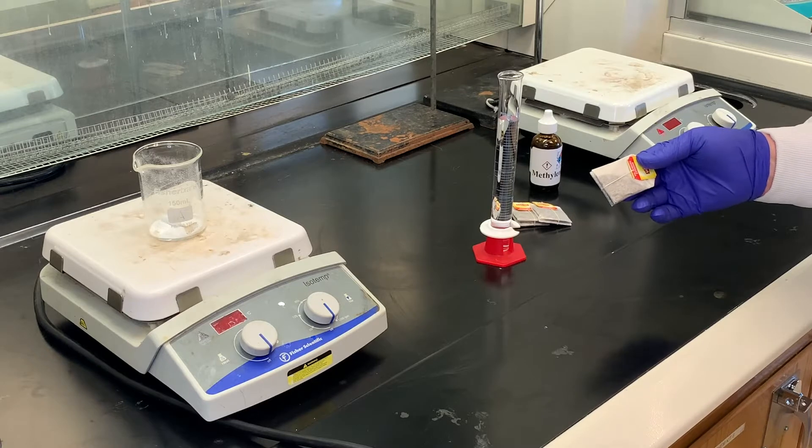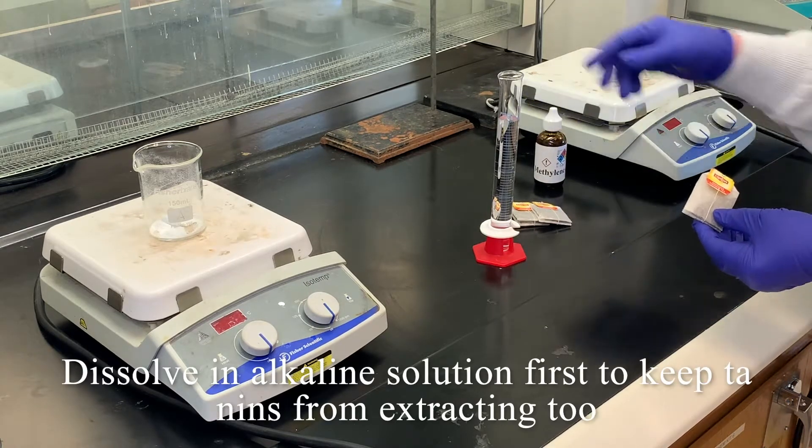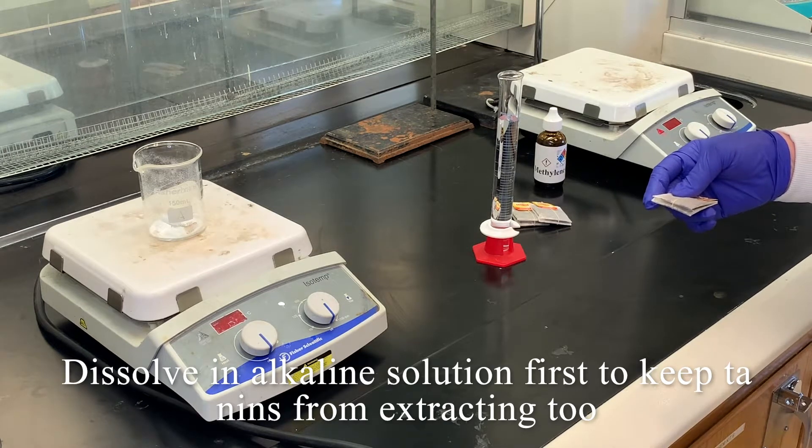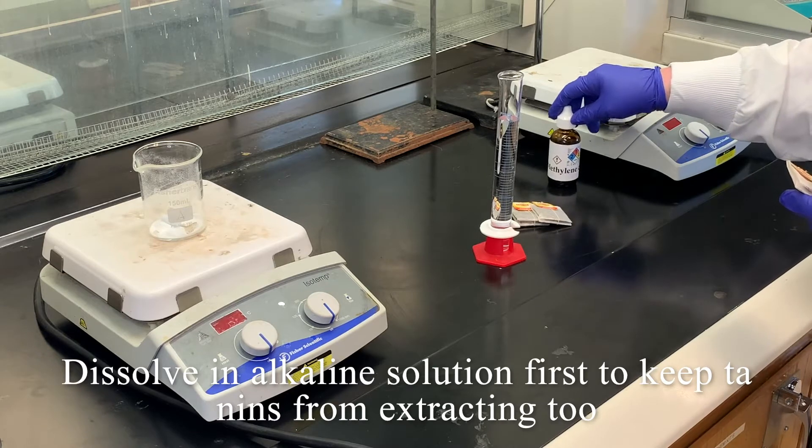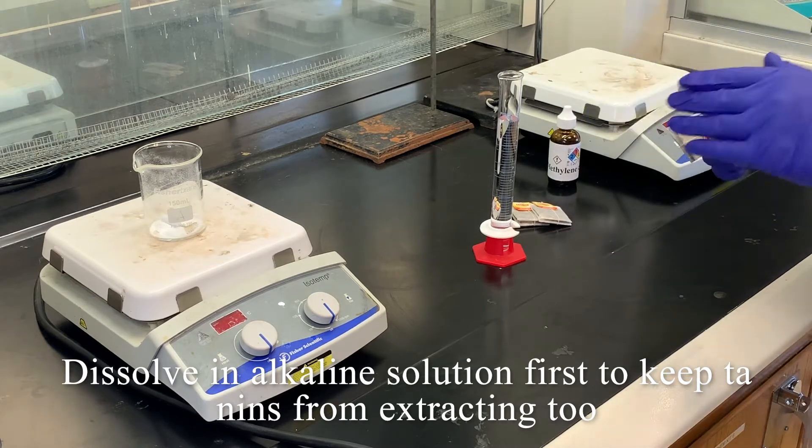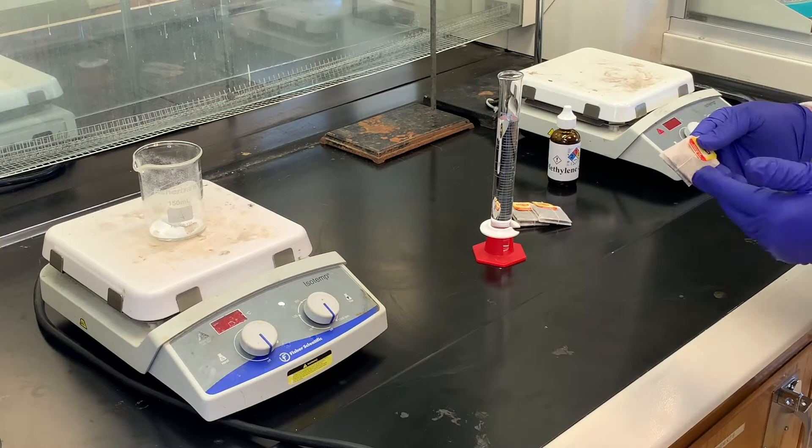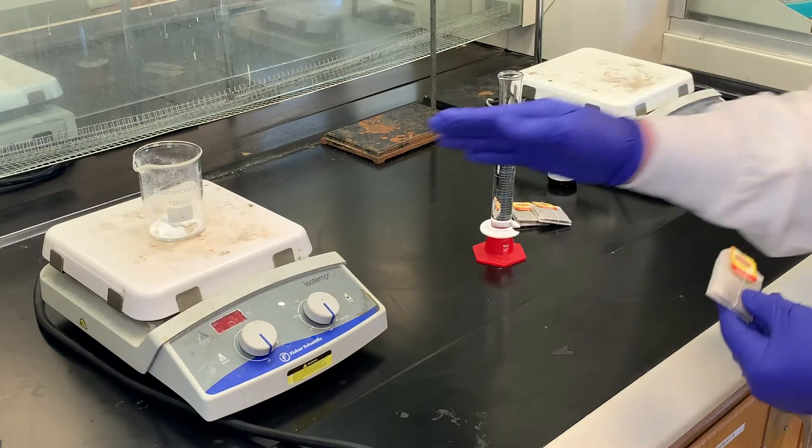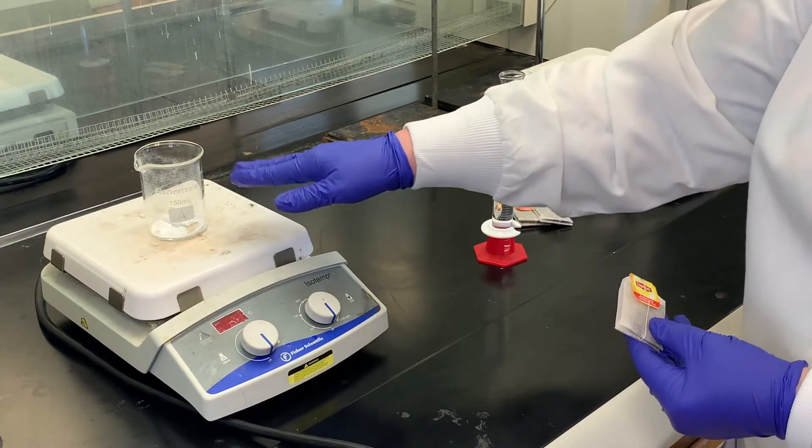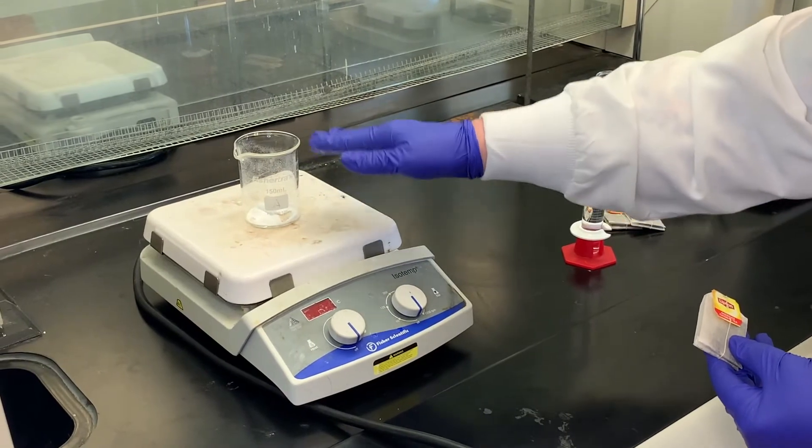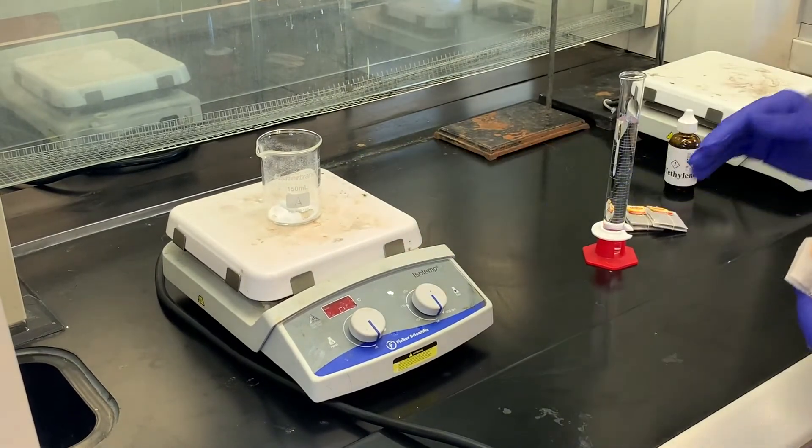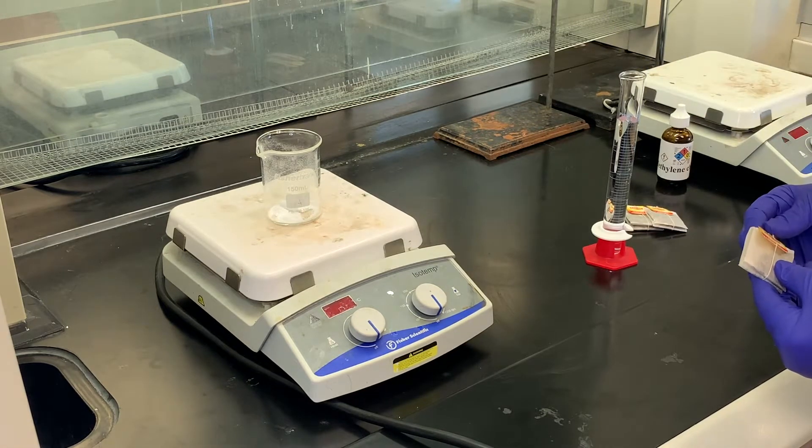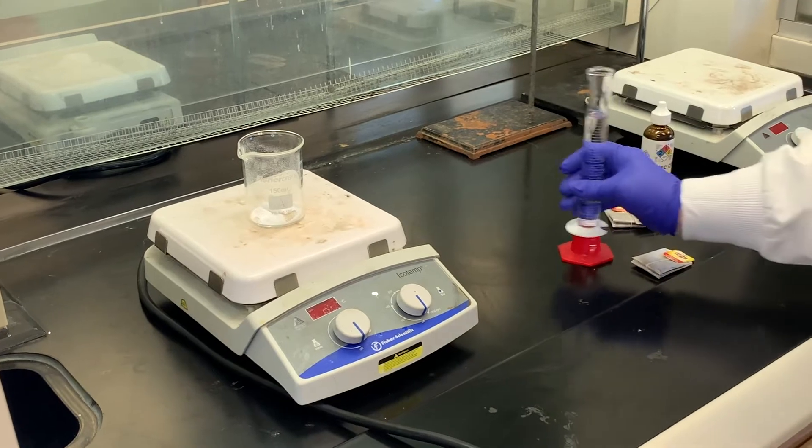Caffeine loves water and also loves methylene chloride. The tannins, if they're not in salt formation, also love methylene chloride. So if we make this solution basic, the gallic acid will form a salt, and all salts love water more than anything else. Once we add water and this alkaline solution, those tannins will remain in the aqueous part. When we add the methylene chloride, we don't have to worry about them transferring over with the caffeine.